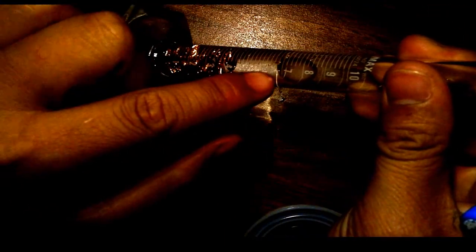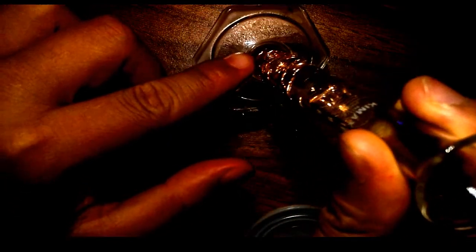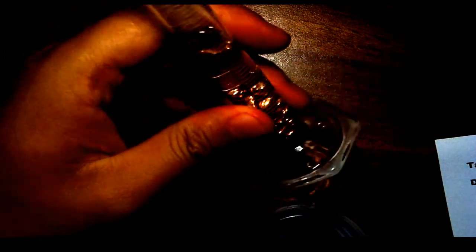And notice how the copper displaces the volume down here. So now our reading is about 7 something, which is not how you're supposed to read the reading. But you can see that there is a change in the volume of the water. So you can see that there's a change in the reading level. And that is water displacement. And we can use this method to find the density of copper if we want to. So keep that in mind.